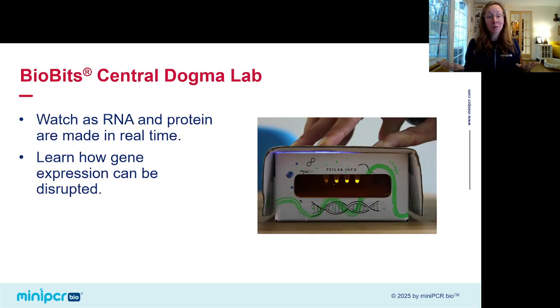So that's our BioBits Central Dogma Lab. I hope you enjoyed our demonstration today. Again, this lab is a great way that you can add hands-on experimentation to your coverage of this essential curriculum area. We watched along as RNA and proteins were produced in real time. We also looked at different ways gene expression can be disrupted.